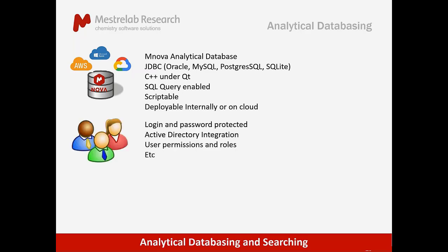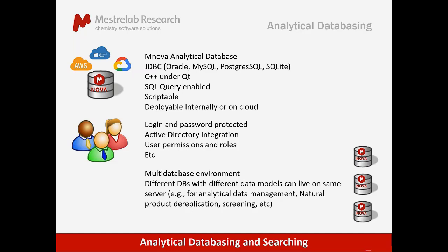We have done that in the past. We tend to work mainly with AWS, but in principle, any cloud environment is fine. Some of the advantages of the database are that, first of all, your data becomes login and password protected. Instead of sitting on a disk where anybody can potentially access it, it goes on the database, and only people that have database access with login and password can access it. For those that have many users, we integrate Active Directory, which means that you don't have to set up each user manually in the database environment.